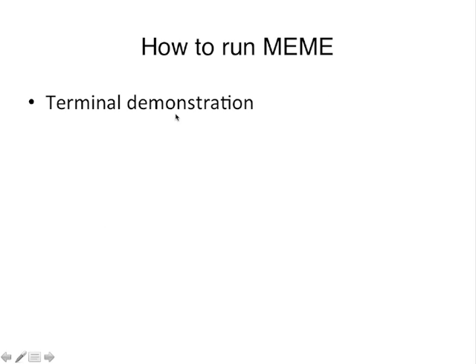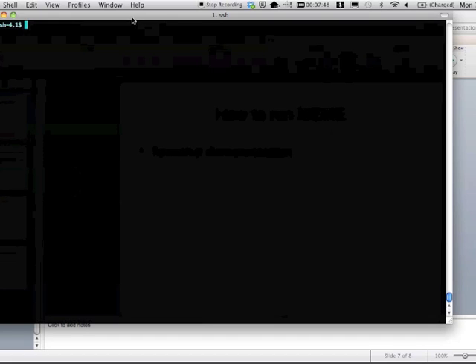Okay, so how do you run MEME? Let's go to the terminal. Okay, so how do we run MEME in the terminal? First, let's go ahead and look at the functions of MEME. So we can go ahead and look for MEME.